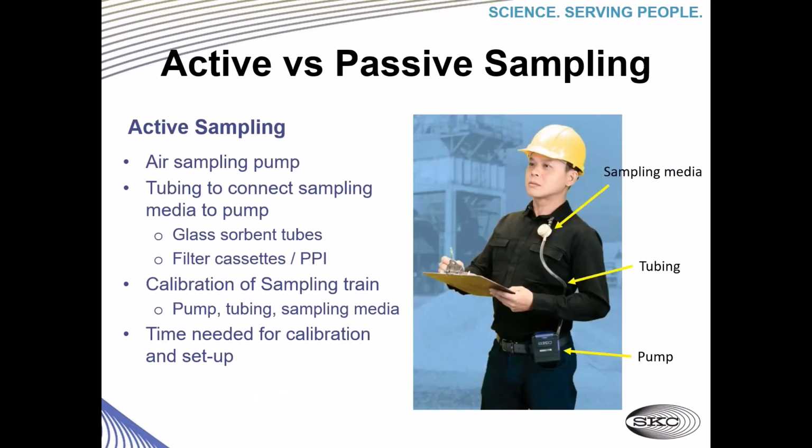So before I go any further and jump into products and applications, I wanted to just take a quick second to make sure that there isn't someone out there listening that doesn't know the difference between passive sampling and active sampling. That may seem elementary to some, but I just want to be sure that everyone understands the advantages to being able to sample using passive samplers if possible.